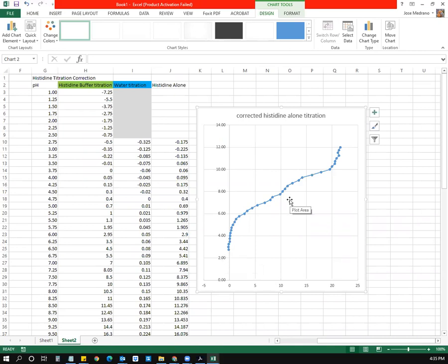But yeah, you should end up getting something that looks a little bit like this, and you should be all set for capturing titrant values at different quarter pHs and doing the actual titration. Again, don't forget for the x-axis to denote that negative values equal the hydrochloric acid titrant and the positive values equal the potassium hydroxide titrant.